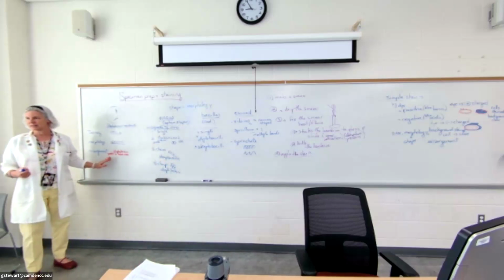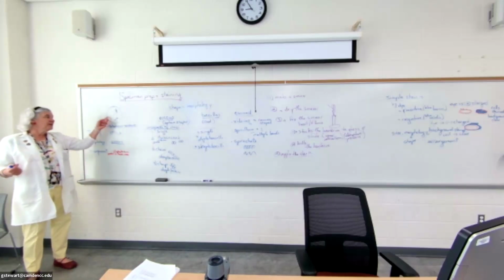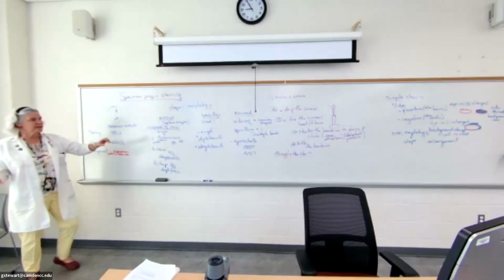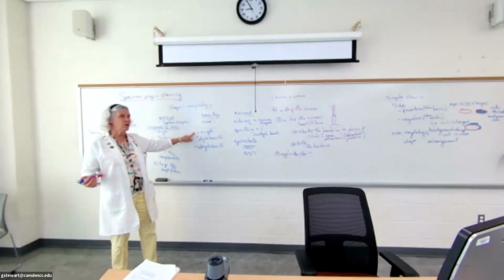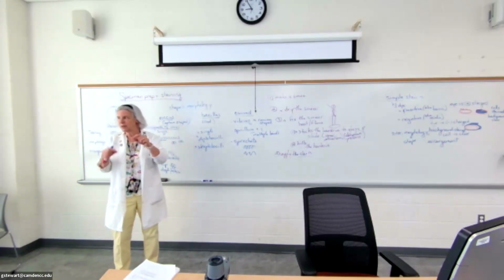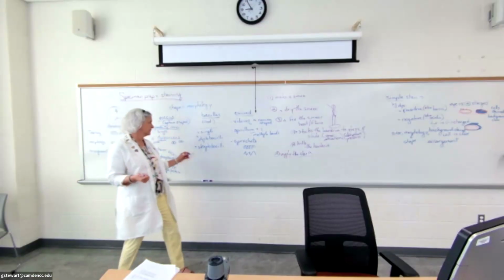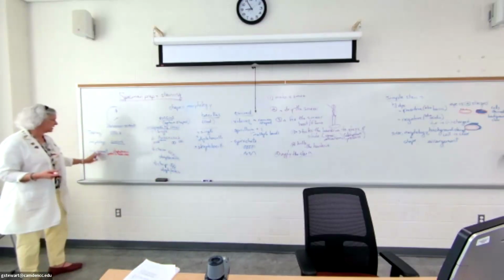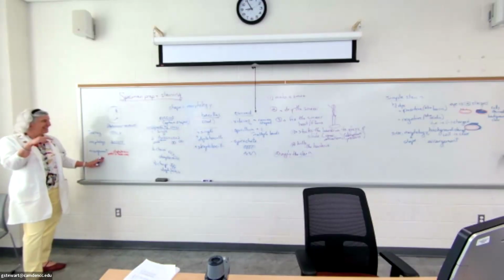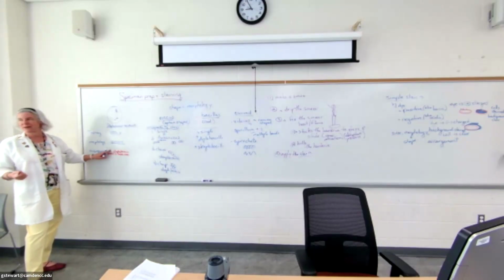on this line, right? Like, meaning, if they're staph, they're gonna look like that. But as far as the bacillus, if you put single, but most of them were in a chain, you can put single comma streptobacilli if you want. That's okay too. You have to put something on the line. And then, like I said, in today's lab, you're only gonna get one line, and it's gonna say morphology and arrangement. So then you only have to use one word. You don't have to repeat. You can just put little s staphylococci.